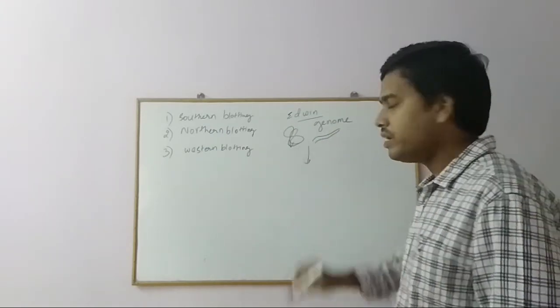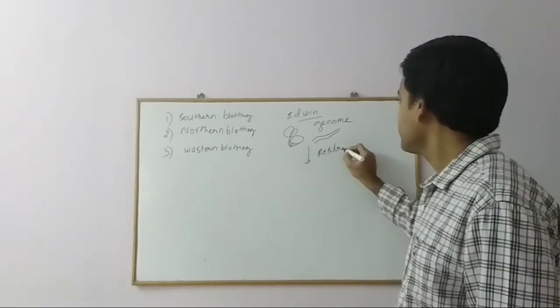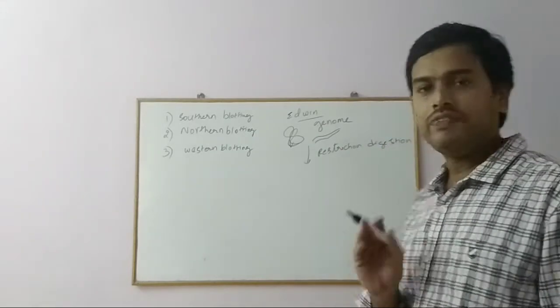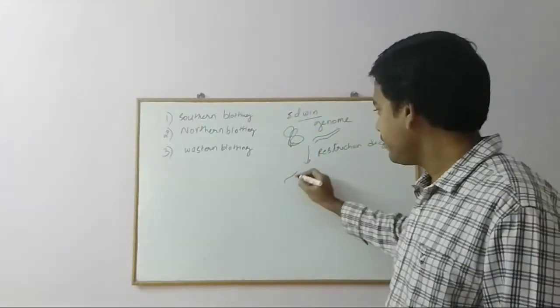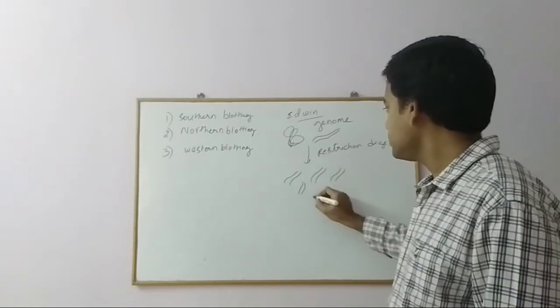Subject this to restriction digestion. After this, you will get DNA fragments, which are double-stranded DNA fragments.